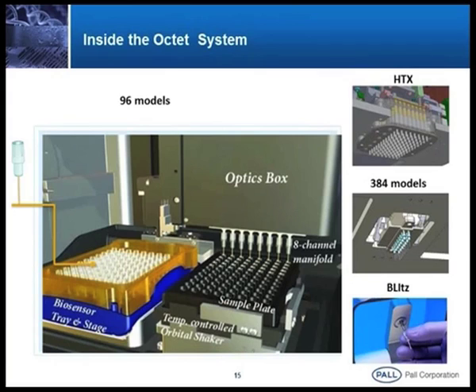So as I said, we don't have microfluidic devices. To assist binding, we require a shaker. The shaker enhances the binding. This shaker can work from 100 RPM to 1500 RPM depending upon the application. Suppose if I am working with a very high concentration, I can use a low RPM, 400 or 500. If you are working with a very low concentration, then I have to increase the RPM speed. So the shaker will enhance the binding.